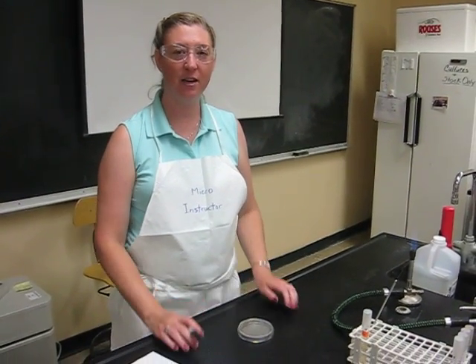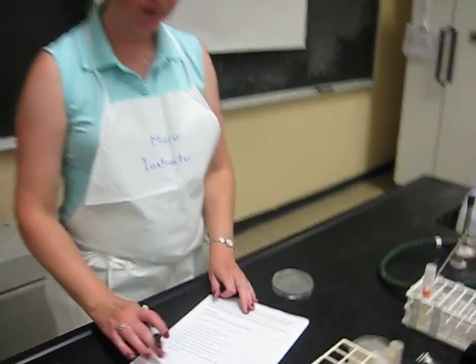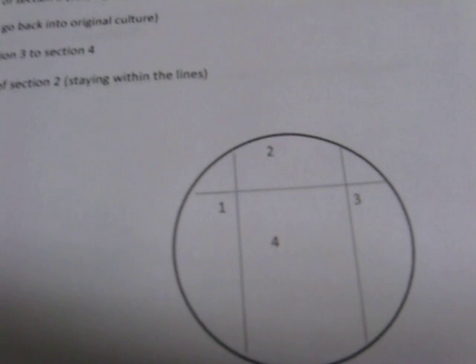So this is streak plate method using the quadrant pattern. I'm going to draw this pattern on my plate to create four sections or quadrants.